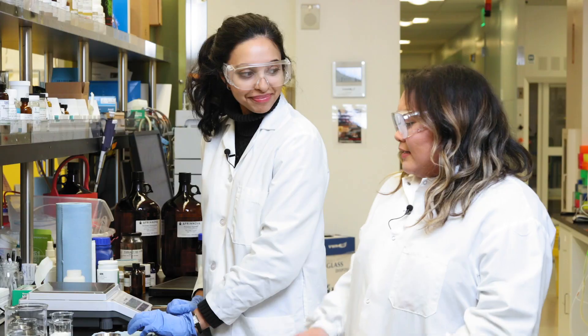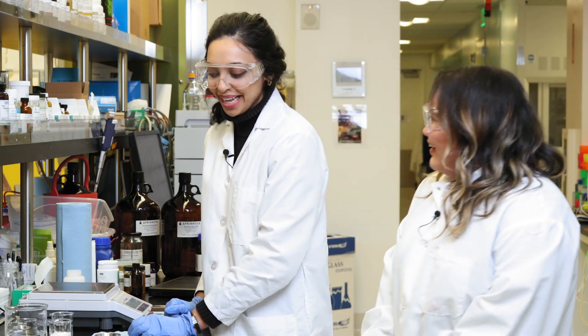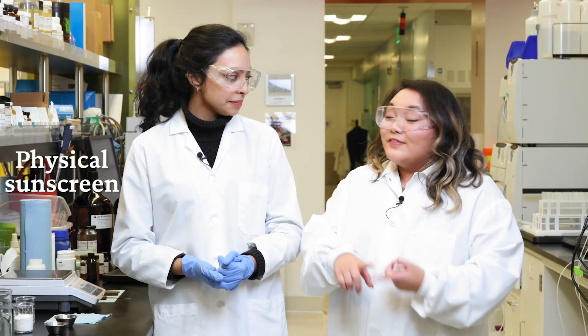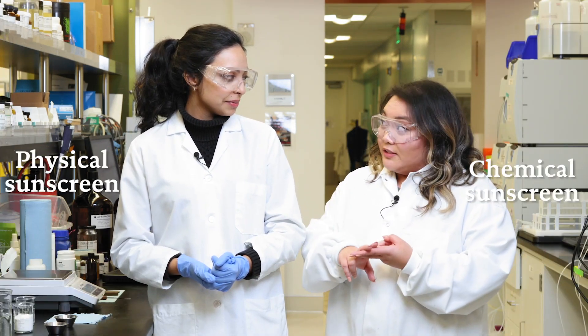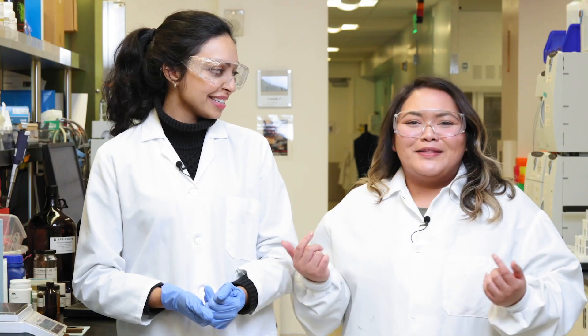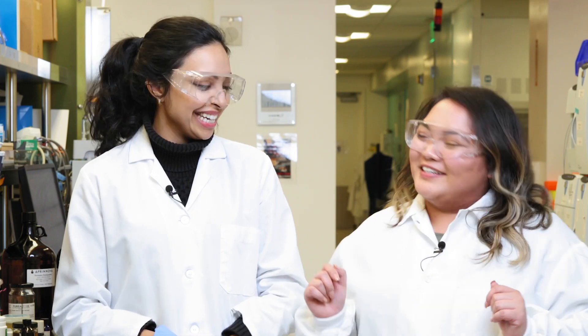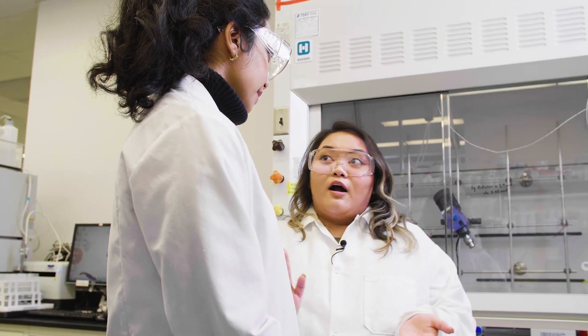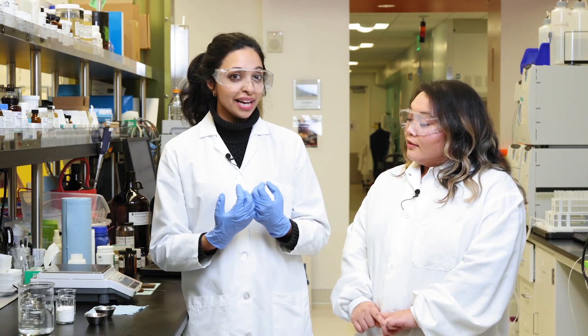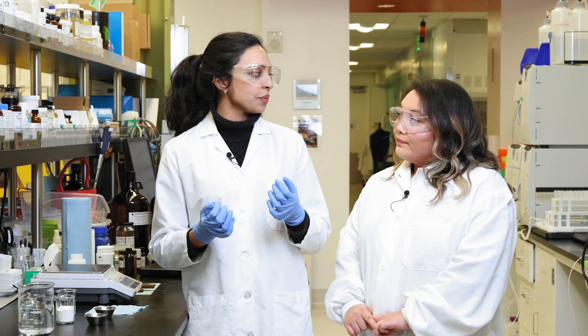I see there's like a white powder substance here. Can you tell me what that is exactly? So what you're looking at is zinc oxide, which is a physical sun filter. There's physical sunscreen and there's chemical sunscreen. That's correct. And ours is physical. Look at me learning — I hope y'all are taking notes too. So why did you decide to use zinc oxide? We really like physical sun filters, zinc oxide in particular, because it's suitable for all skin types. One of the things we really wanted to achieve in this formula is something that blends into skin, so we spent most of our time doing that.